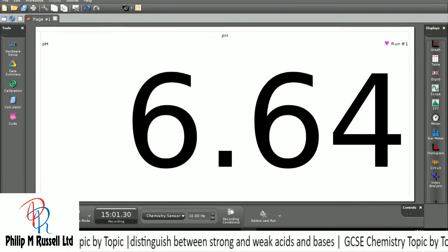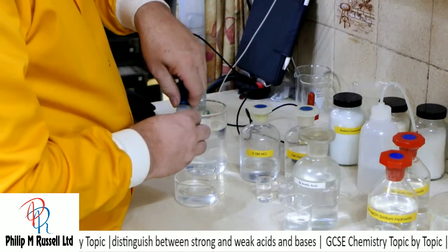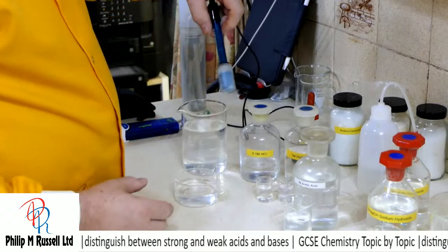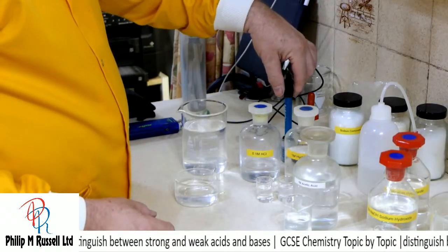There we are, it'll do. And I'll push that in, lock it in tight, and that will keep this pH probe in working condition.